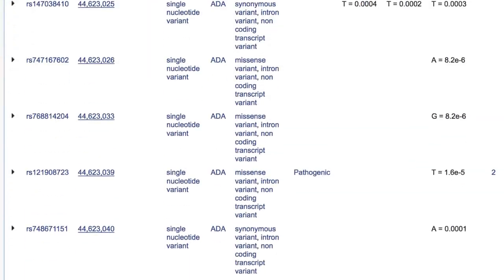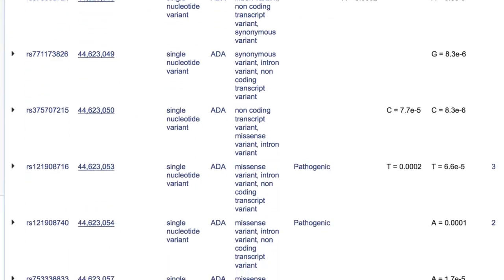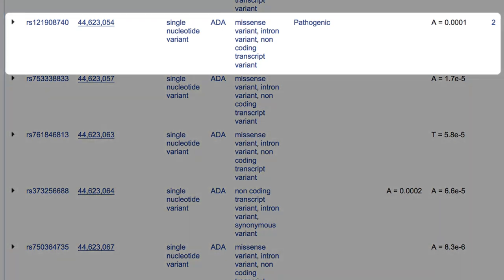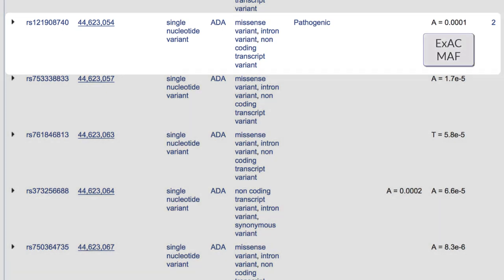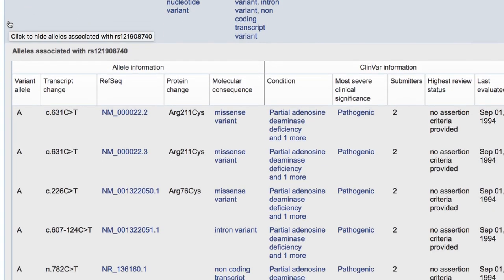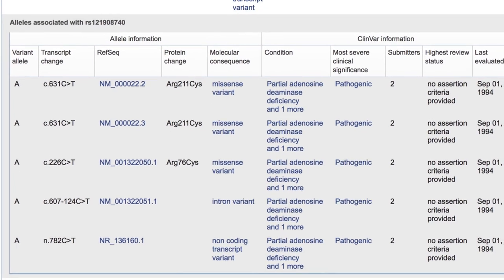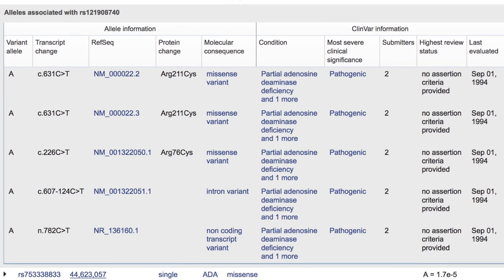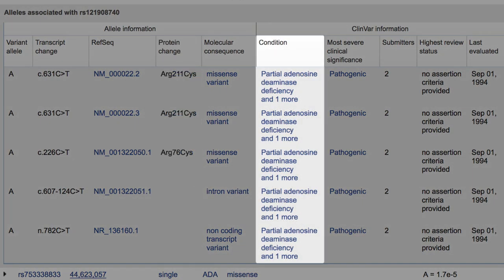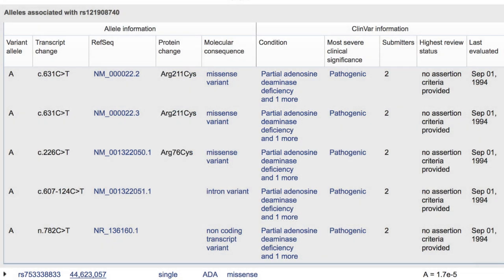And in the variation table below, we verify that this is a missense variant with a very rare but measurable minor allele frequency. And by expanding this entry, we get allele information such as the protein change and ClinVar assertions about condition. So this call clearly merits further investigation.